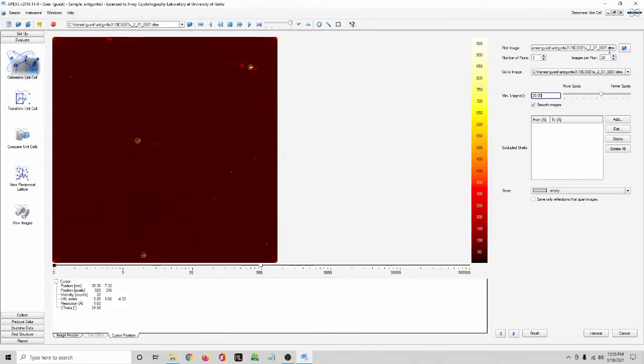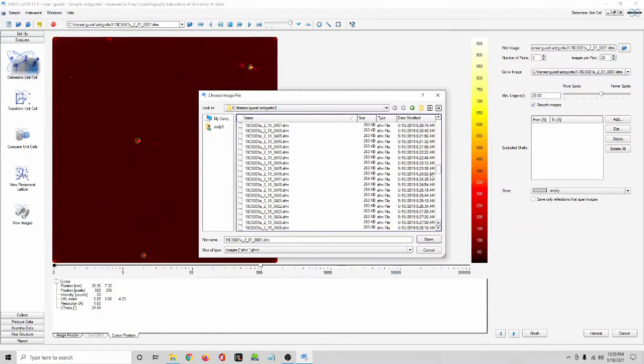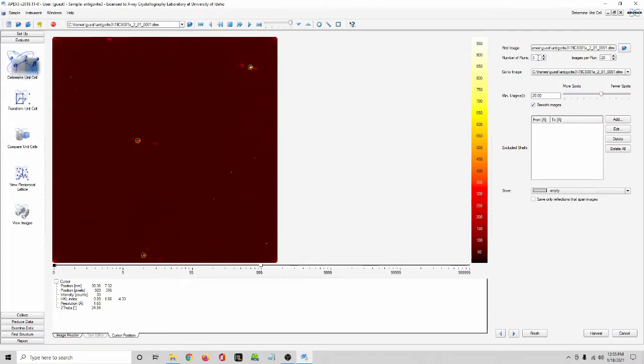The major difference between doing a normal structure and a modulated structure, at this stage, is that I would recommend harvesting a lot of frames so that we get a lot of reflections. So we've collected 22 runs here, that's a lot, and almost 500 frames per run. It looks like you can do all of them, that'll take a long time, so all the runs, but I'll do 200. And this is going to take a little bit.